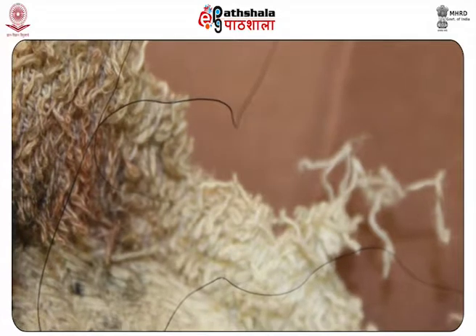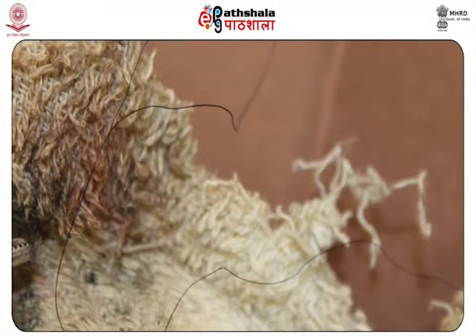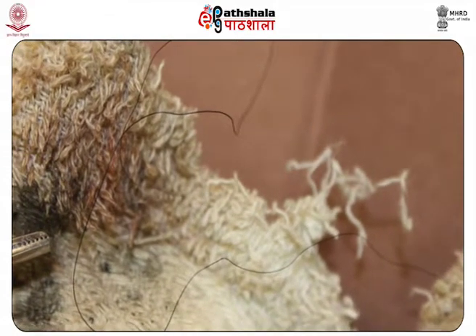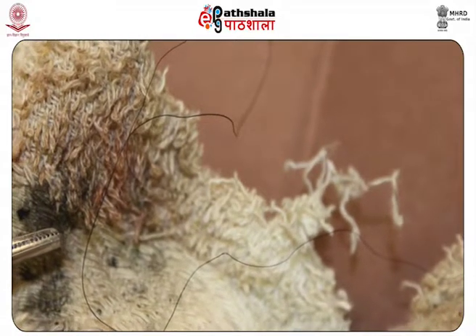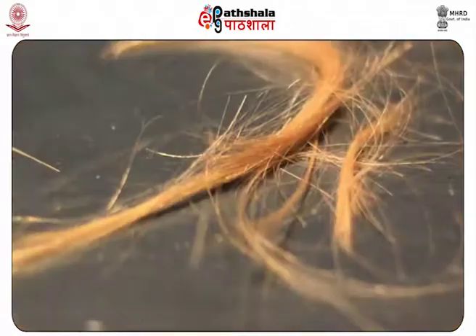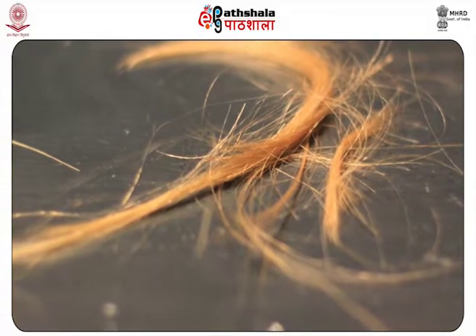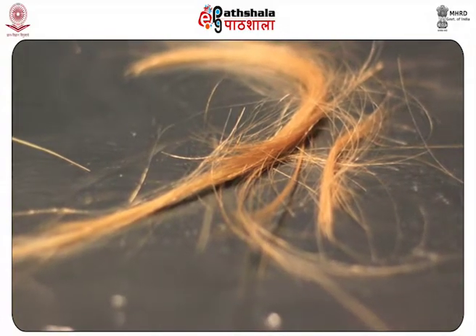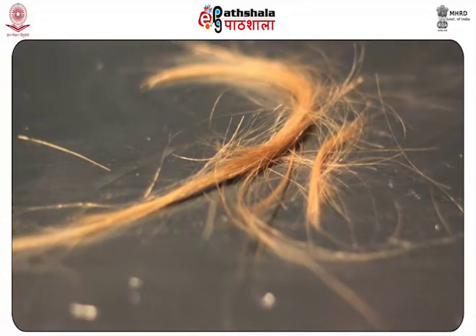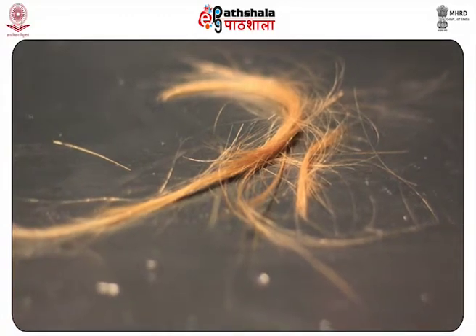If the disputed hair displays the same minute features as the known hairs, it is established that the hair is consistent with originating from the animal. It is noted, however, that animal hairs do not retain enough specific microscopic features to be linked with a specific animal to the elimination of other similar animals.